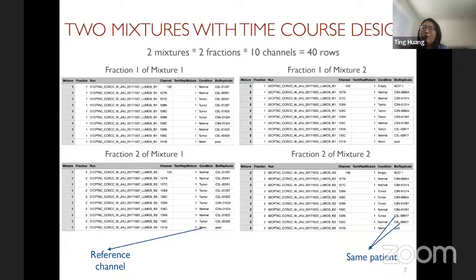We sometimes separate the annotated sequence based on a certain pattern, so if the character you use happens, by coincidence, to be the same pattern as what we use in the code, then it will cause an error. I think we can double check it and answer you later.